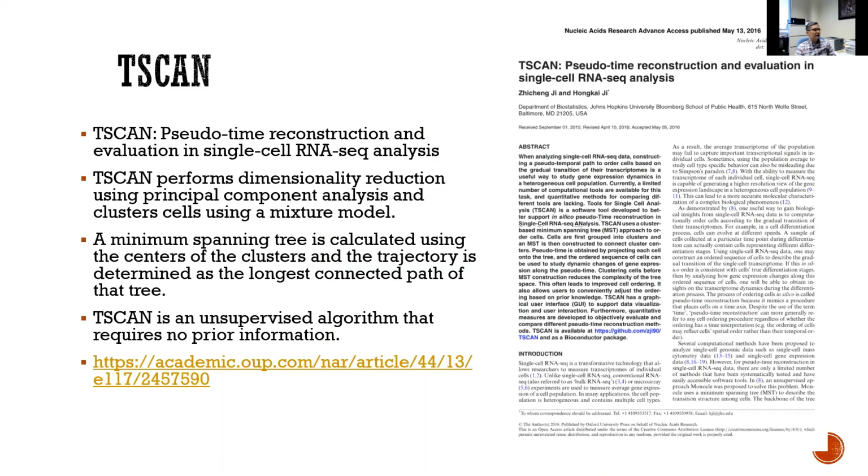As I mentioned, TSCAN is another trajectory analysis package, published in Nucleic Acids Research. They use PCA to do the dimension reduction, then use minimum spanning tree as an algorithm to create the trajectory. It's an unsupervised algorithm. Okay.